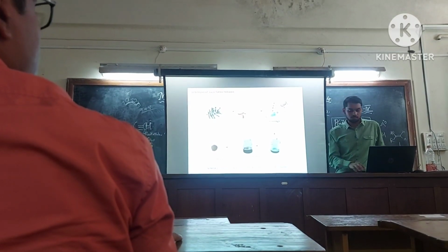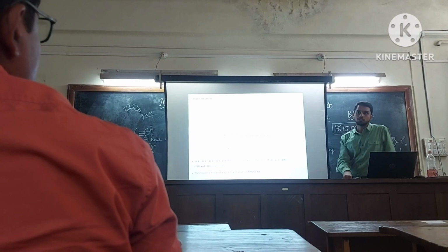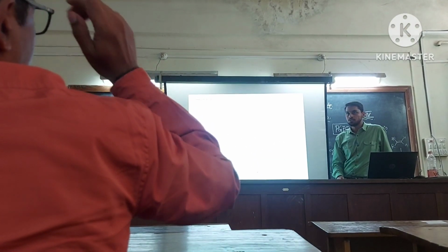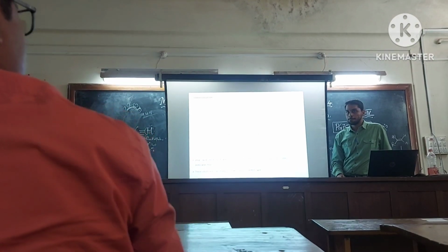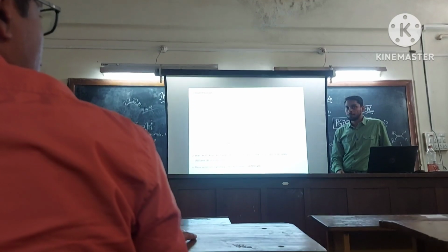So next one. You just compared this one. There is no other. You said it is copper. Generalized comparison, you made it with a library, or as such copper oxide is there, like you made it.